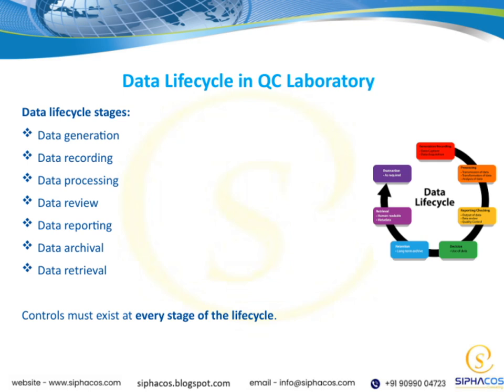The key point here is that controls must be in place at every stage of this life cycle. This is essential to maintain data quality, integrity, and compliance throughout the entire process. By understanding and managing each stage carefully, we uphold the standards that are critical in a QC environment.